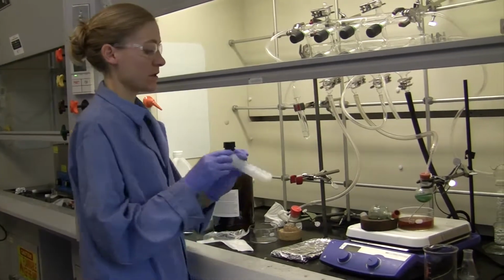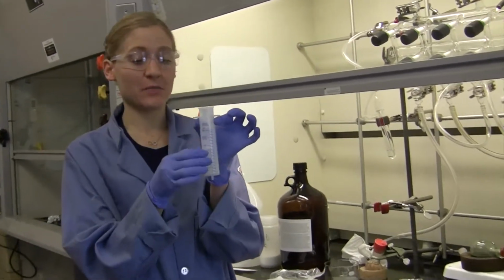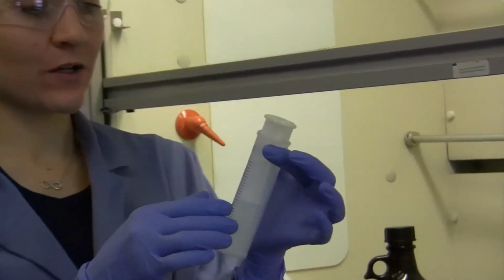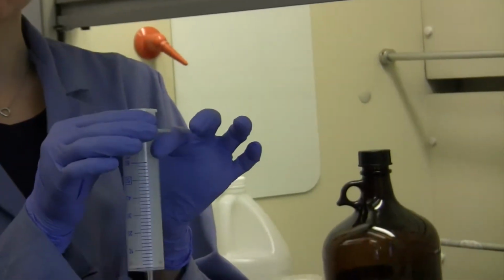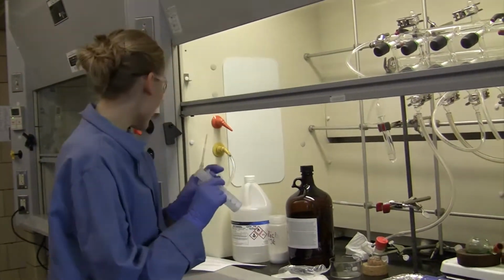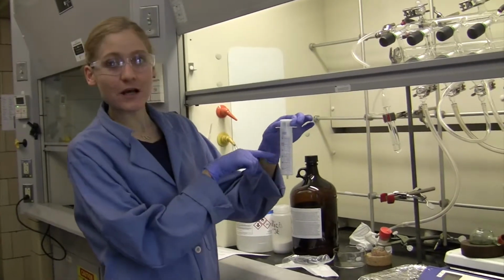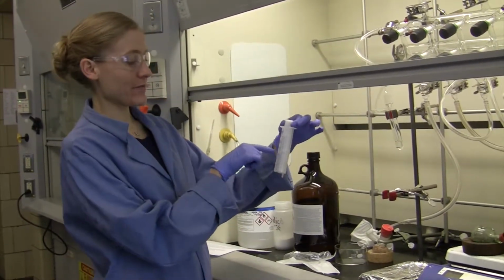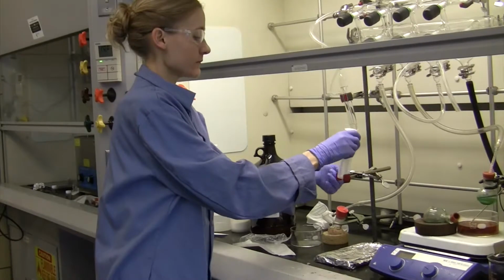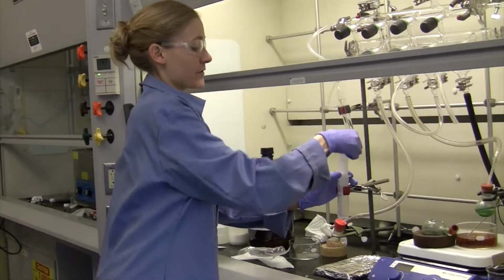For this, we'll just be using a 50 ml syringe. It is a plug that will be running, so you don't need to use the regular glassware for this. And conveniently, we're going to be running through just about 30 mils of silica, so it's conveniently bunched. First thing we want to do to set this up as a column, remove the plunger.